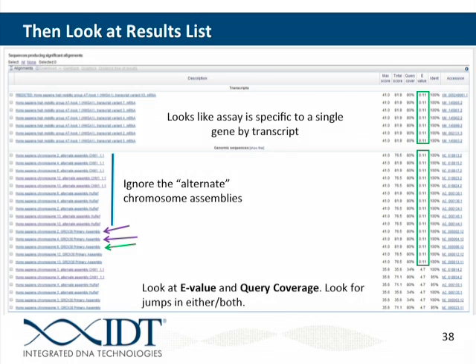You want to make sure to check the distance between the primers binding to make sure that it's an actual potential threat. So if there's a huge difference between where the forward and reverse primer lays down and an amplicon isn't ever going to actually form there, then it's not something that you need to worry about.